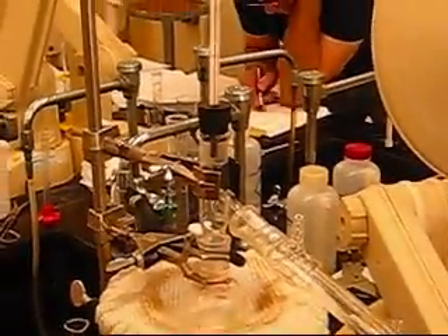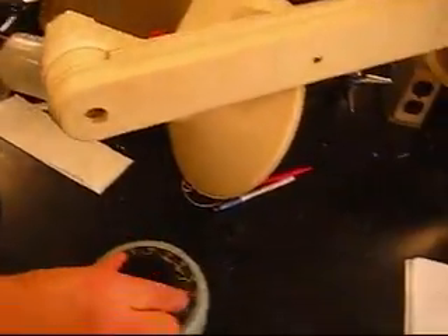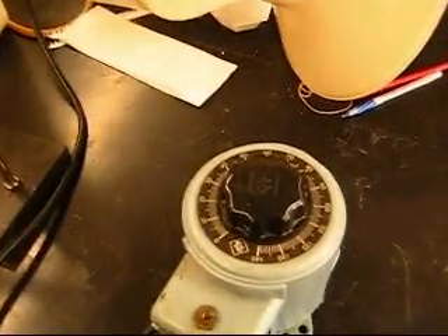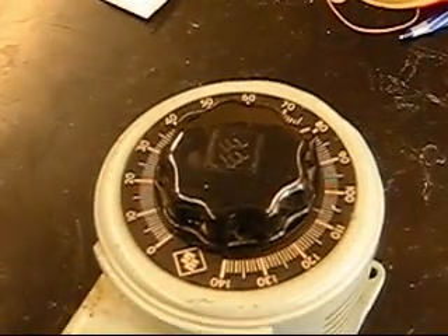So let's go ahead and turn it on. We turn our temperature dial here. Right now we're just concerned about getting it hot so it evaporates. Part two.